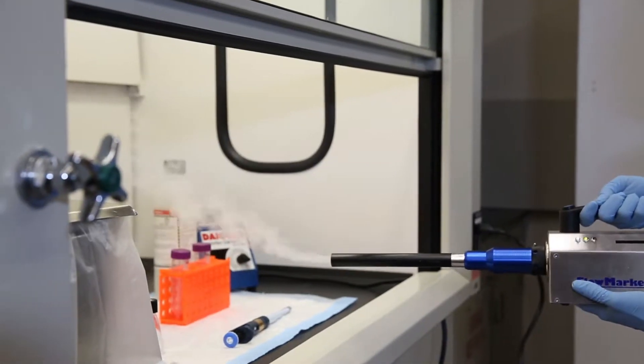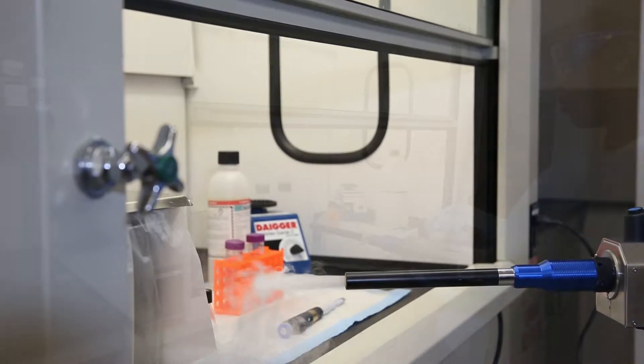Many conditions can affect the efficiency and safe operation of a fume hood.